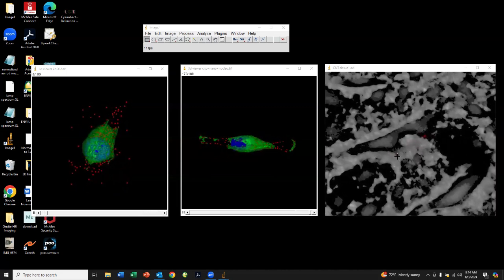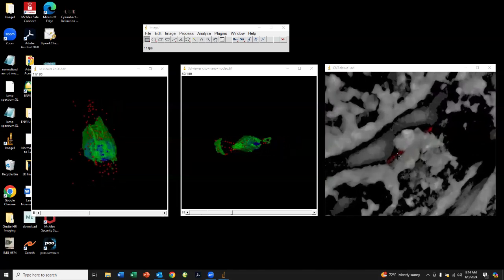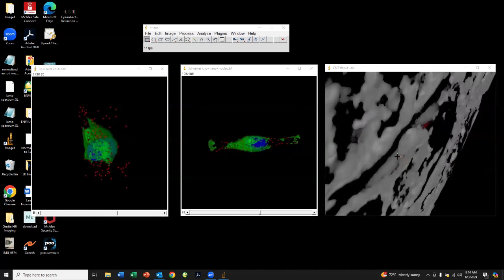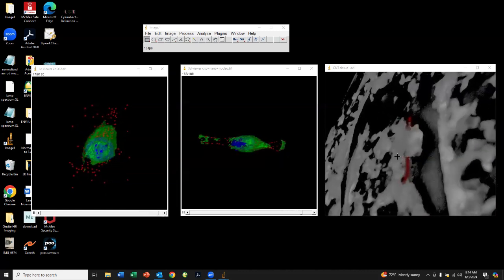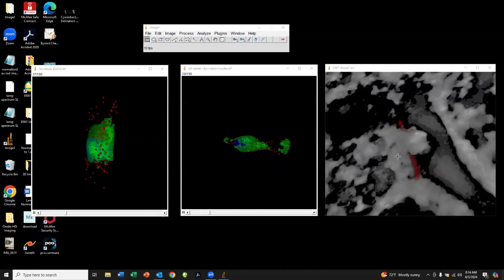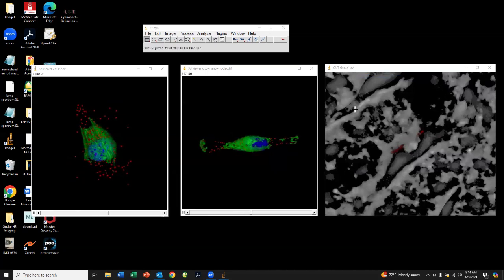So these are three videos which demonstrate the ability to see nanoparticles in the X, Y, and Z in 3D optical imaging. And of course, with CytoViva, you can capture a hyperspectral image of any of the areas of 3D stacks of these images to be able to confirm spectrally nanoparticle presence in these cell and tissue areas.